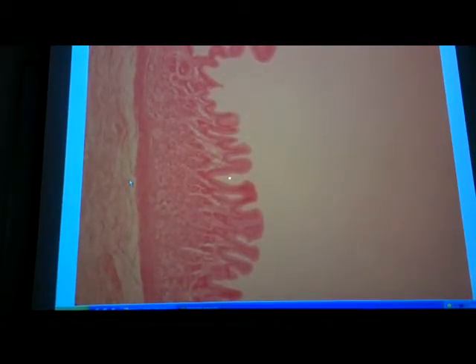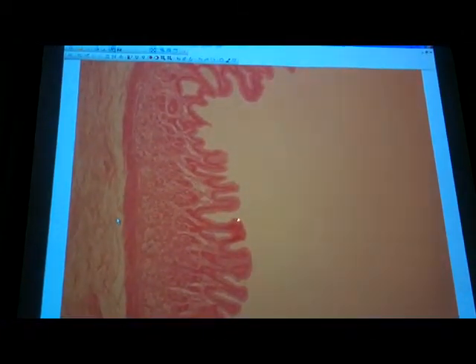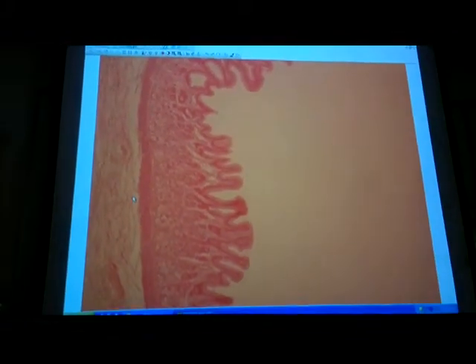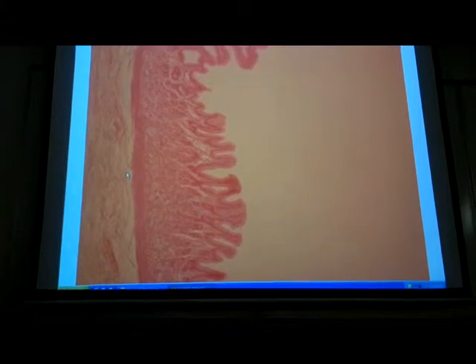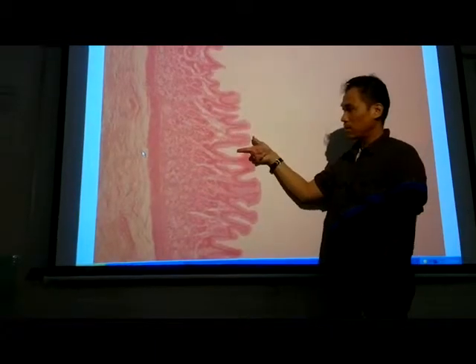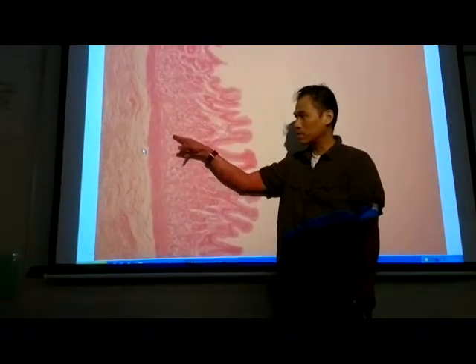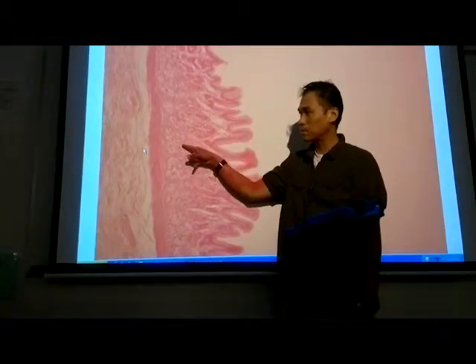If I point this out, where are you going to put it? Gastric pit or gland? It looks like a pit to me. Call it a gastric pit. Remember, in lecture I said the stuff deeper is what? Gland. So let me break this down. Stomach, I'm going to ask you in particular. Gastric gland. Yeah. You can't even see the glandular structure. There are peptic cells in there, the chief cells. What's that?